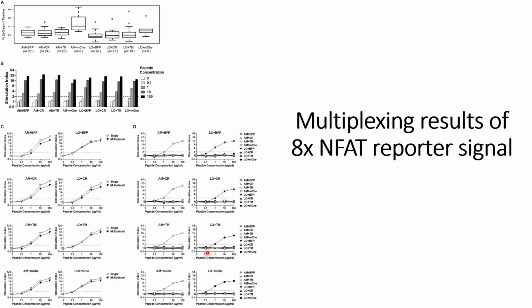different fluorescence combinations. So this also indicates that multiplexing these NFAT reporters gives reliable results even when multiple T cells are present. These signals are not affected by the activation of another T cell, but are the results of the actual activation because of the peptide or the antigens for which the T cells are designed or are sensitive. So that's all for this video.